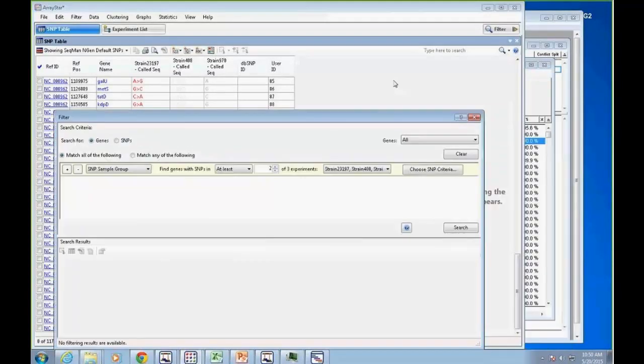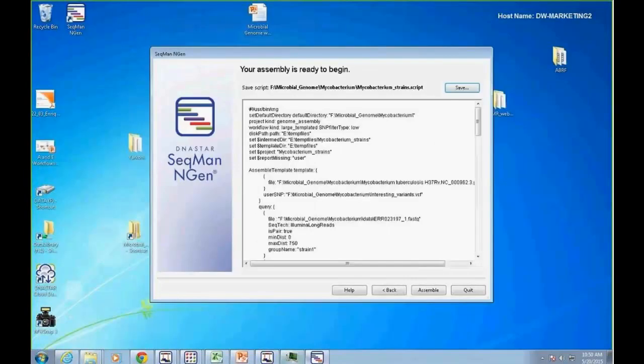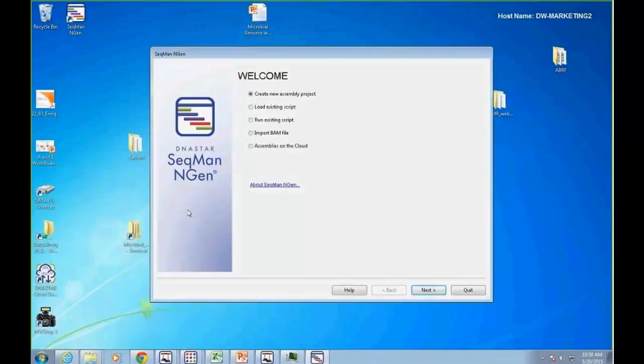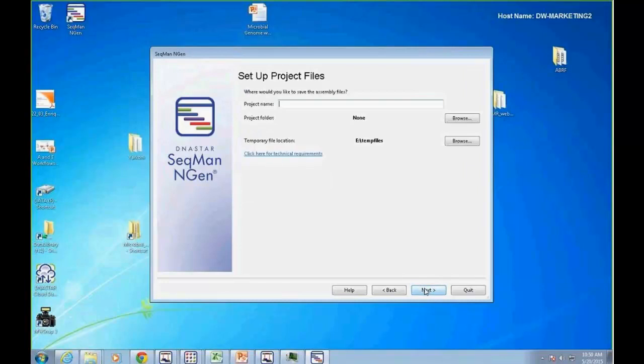Okay, so lastly, I'd like to show you one other workflow before we finish up here. And so I'm going to do a metagenomic workflow. So that was three genomes that we compared, but what if I have a mixed sample and I want to sort through it? I can pick the metagenomic workflow. We'll do a templated one. And so this is some cow microbiome. So pretty common for an environmental sample where it's an unknown mixture and you want to figure out what's in that sample.